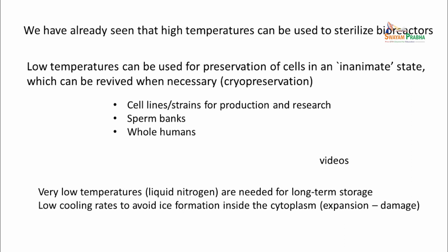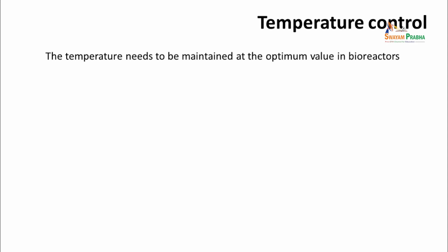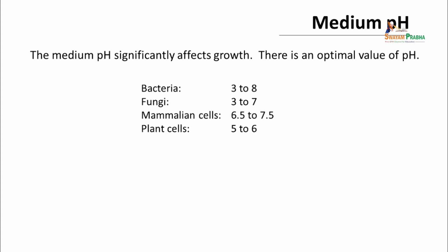There was some reference to videos. I hope you have seen them. They are interesting videos. And then we looked at some aspects of temperature control. Then we went on to medium pH.